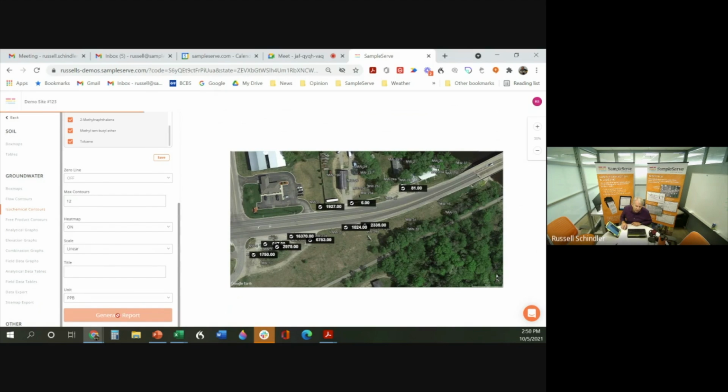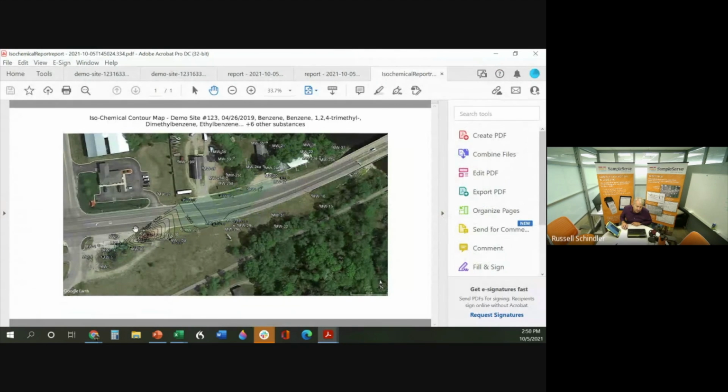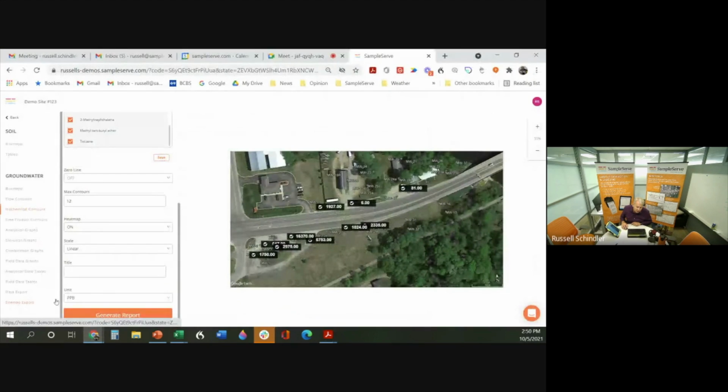I'm just going to hit generate report, and you see it's going to be a weird contour because there's another feature that we've added now, because when you're doing it, it's not going to be quite a very pretty contour. Now, whenever you're doing these kind of contours, there's always artistic interpretation. So what we allow the user to do is place a 0 using a right click, because of 16,370 here, it needs another data point in order to do a contour, right? So you'll have 2 data points, and then you can contour the intervals in between based on your other parameters over here. But if you don't have other data points surrounding your values, unless you've got a 0 value, it's going to have a hard time figuring out where the contours are at.